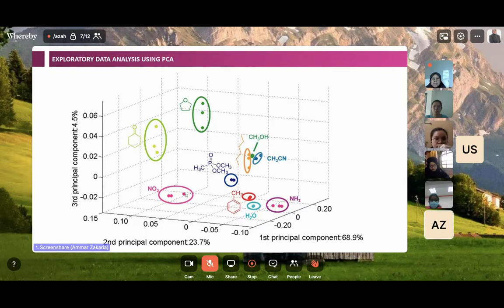Bear in mind, you need to know that the grouping was done manually, right? We ourselves need to group them, need to draw a circle around the dots, right? Again, this process is not really convenient. Every time of the experiment, this one should be in one group, this one should be grouped together, this one should be separate from this group, right? It is quite tedious, right? It's difficult to determine whether this belongs to the same group or not, right?